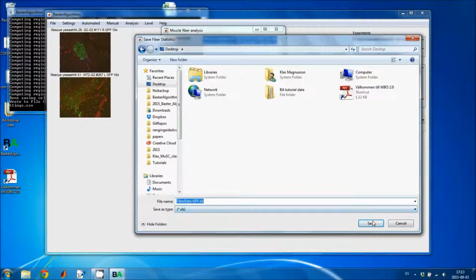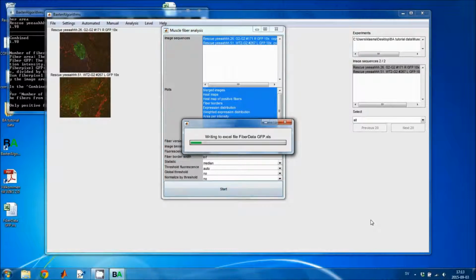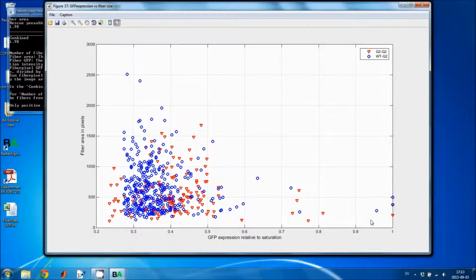And I will save it on the desktop. And now the processing is finished.